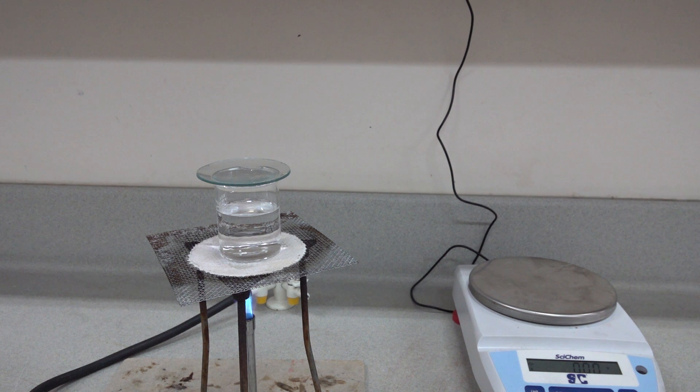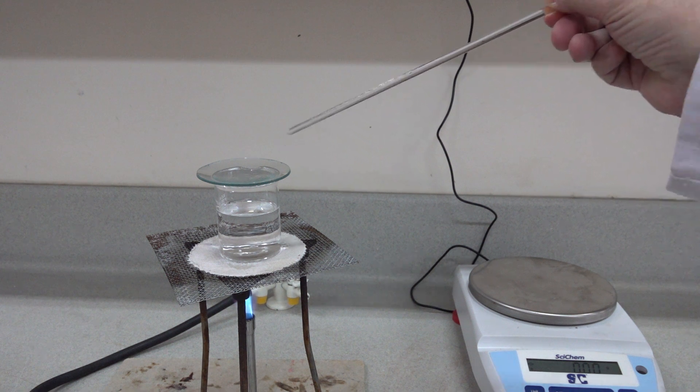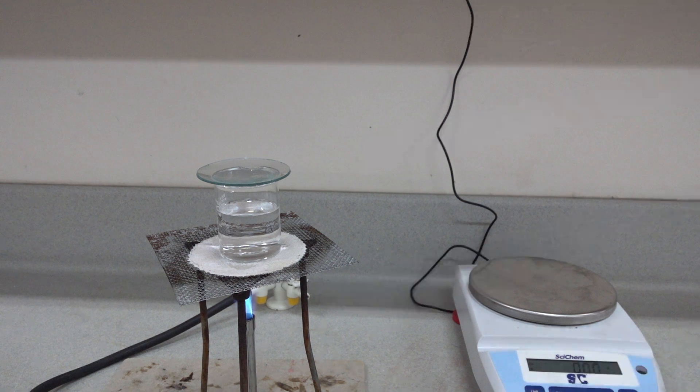So the object of the exercise is to evaporate the solution on the watch glass to dryness, remove all the water, and then re-weigh on the balance. Repeat this process until a constant mass is achieved.